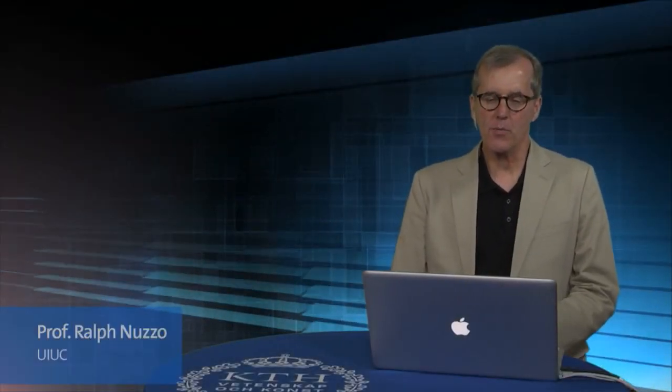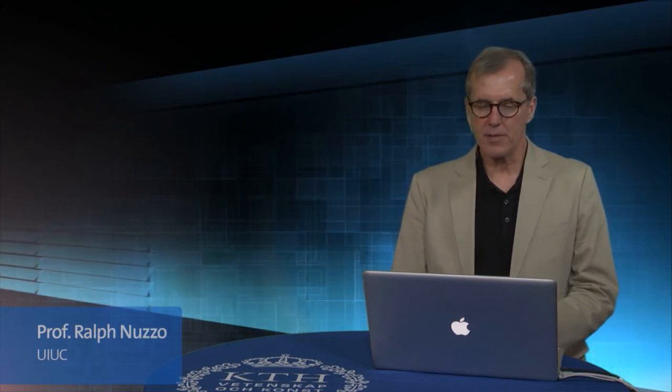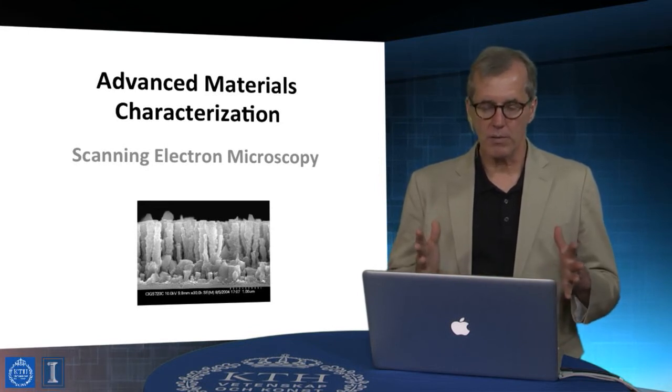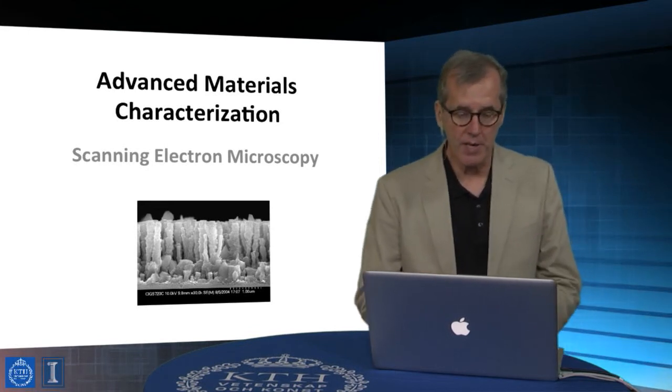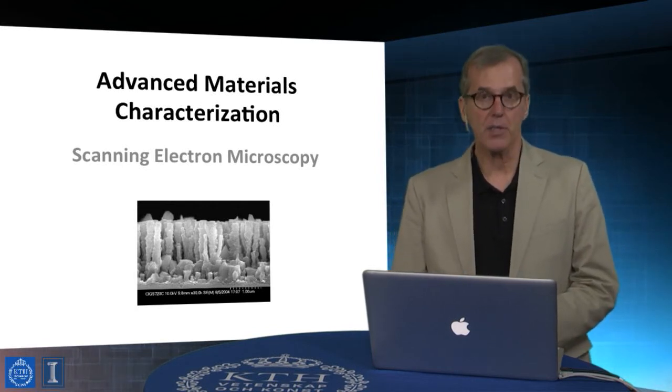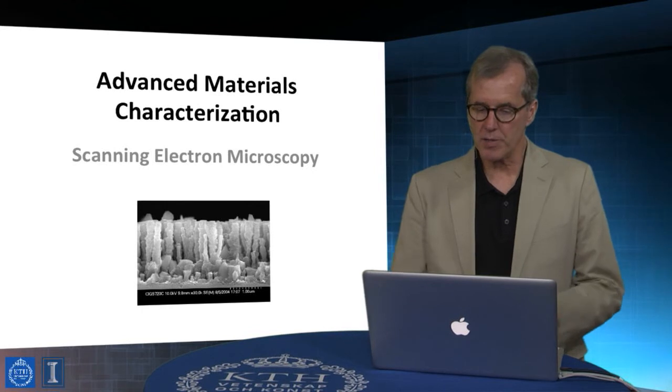Hello again. In this lecture, I'd like to talk about what I would characterize as unquestionably being one of the most important analytical tools that's used in all of material science. And I'm talking about the applications and utility of scanning electron microscopy.